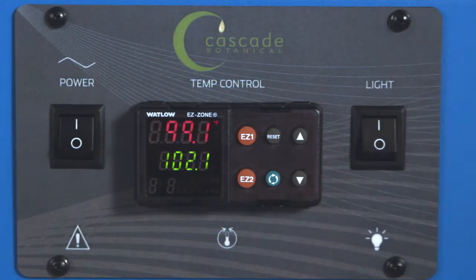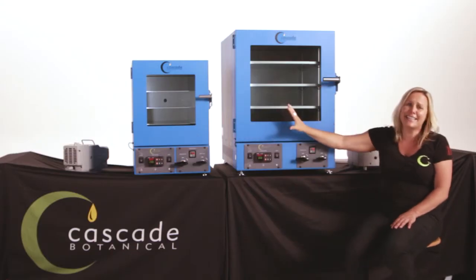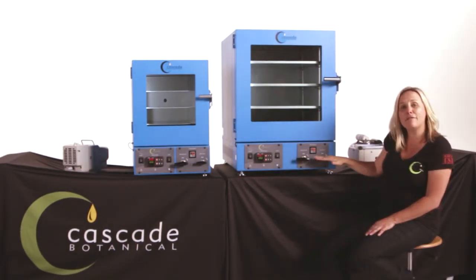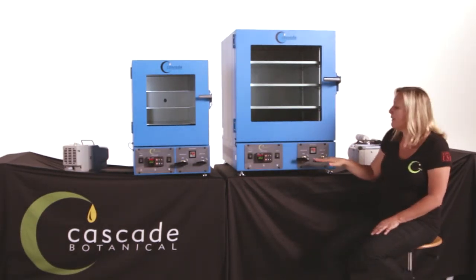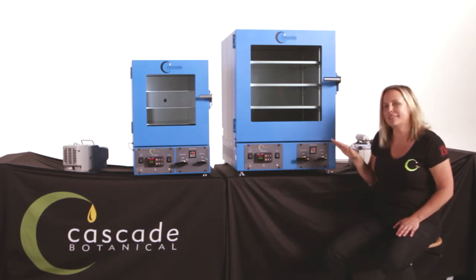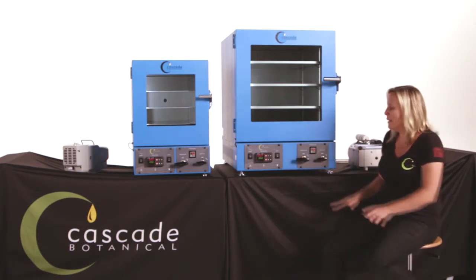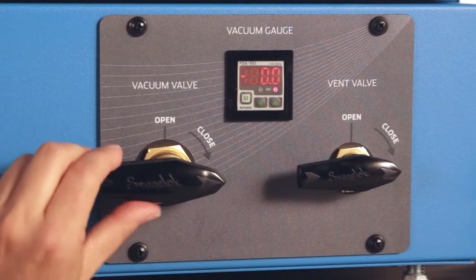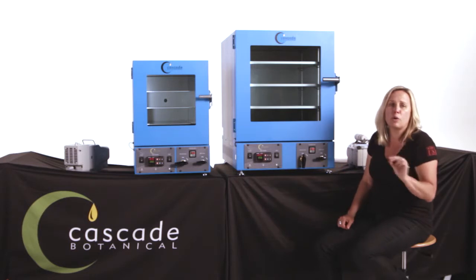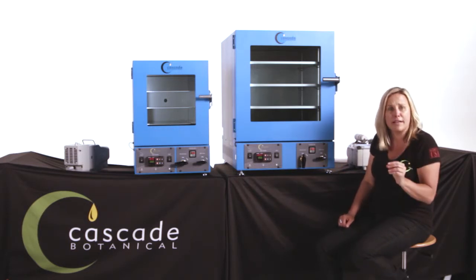The integrated light switch offers pure, clean LED light — sorry, no party colors here. And then we have our new valves. These are exciting. These are still Swagelok, still made in America, still the best you can get. But now they are a simple quarter turn to open and close, and there is so much more precise feathering available.